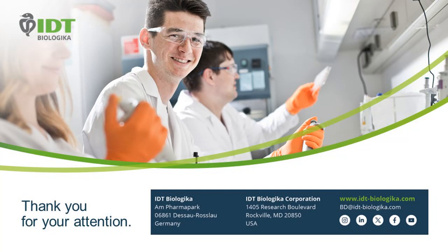Roughly what percentage of the AAVs that you work with are natural serotypes versus engineered? Yeah, so we haven't evaluated the performance of our platform process yet with modified AAV serotypes. We just concentrated at the beginning on the most common established serotypes in the market right now.